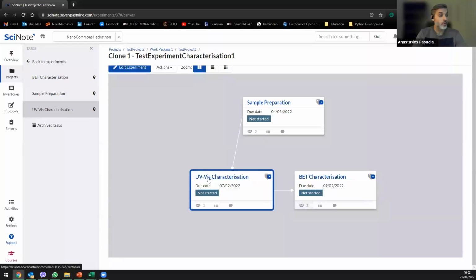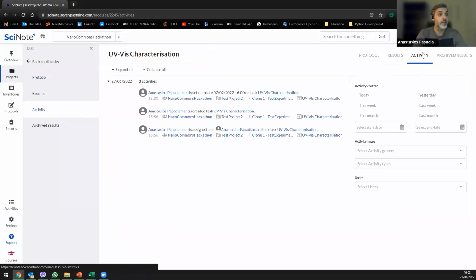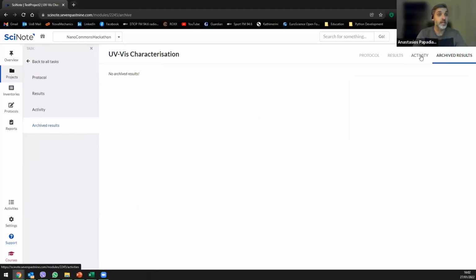So what we want, let's say if we go into the UVVs, then you have on the top right corner different options. You have the protocol tab, the results tab, the activity tab, and the archived results. As I said in the past, you cannot delete anything.